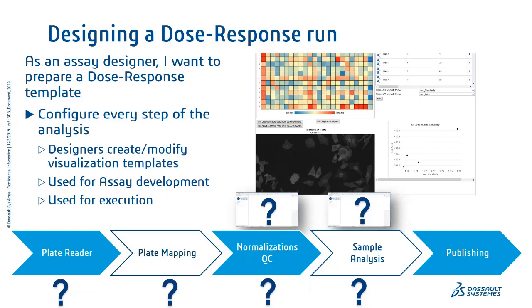So how I will perform every single step of the analysis. So choosing the plate reader, how I understand the instruments, doing the plate mapping, the step of normalization and QC, I think are the most appropriate for that type of assay. Same for sample analyzing, and finally publishing.